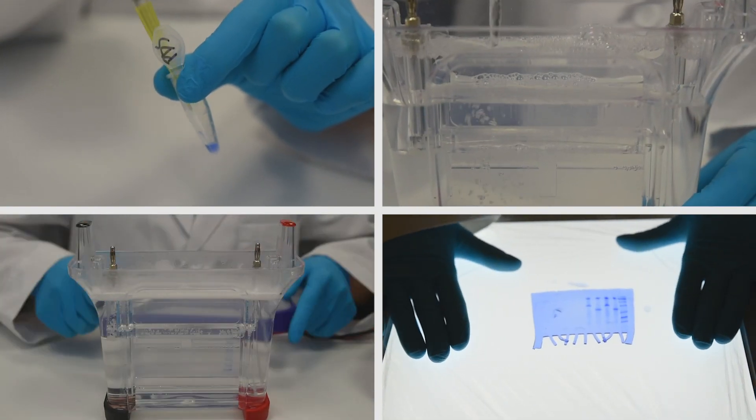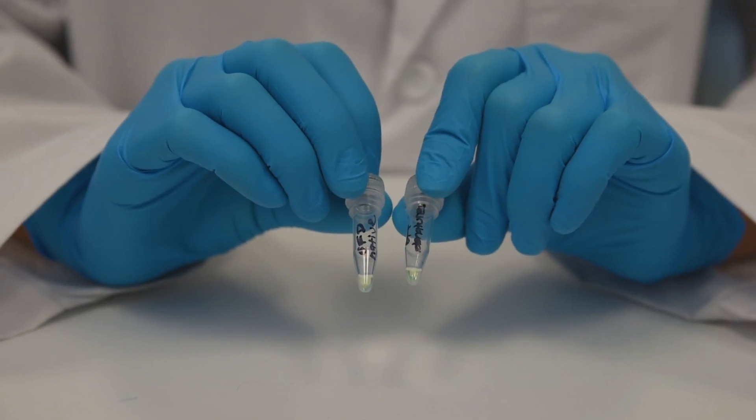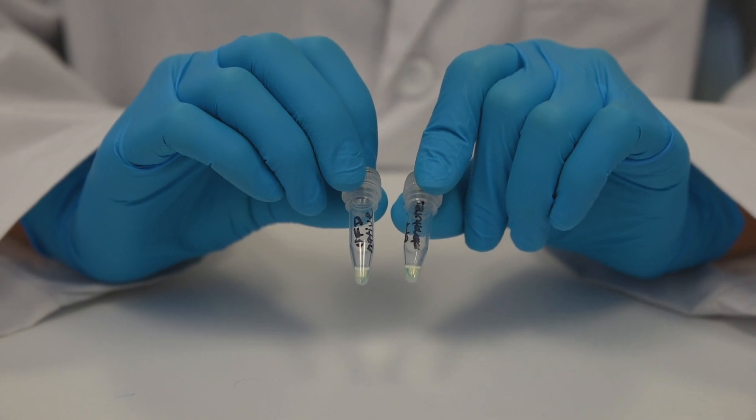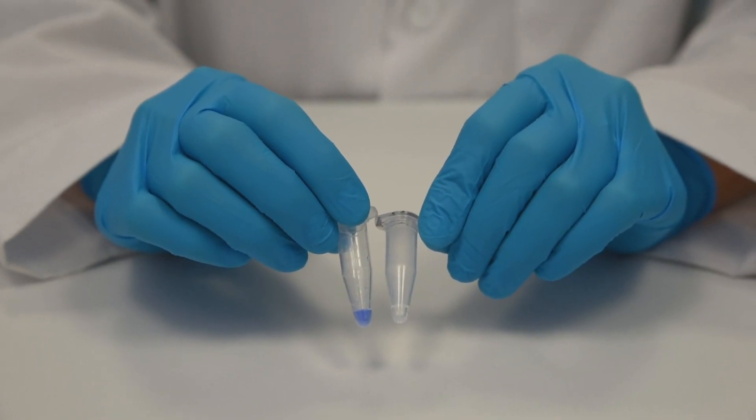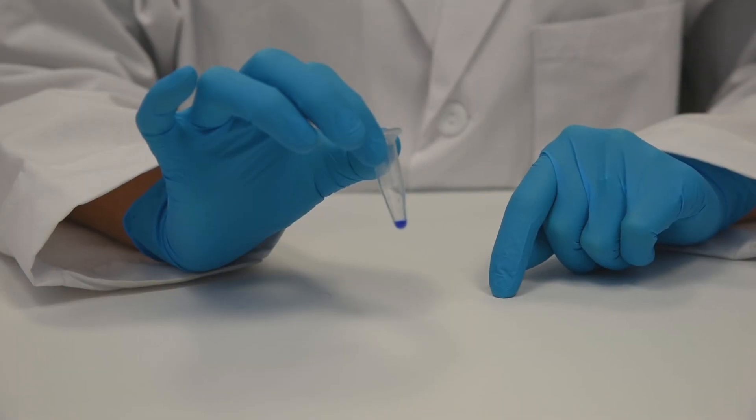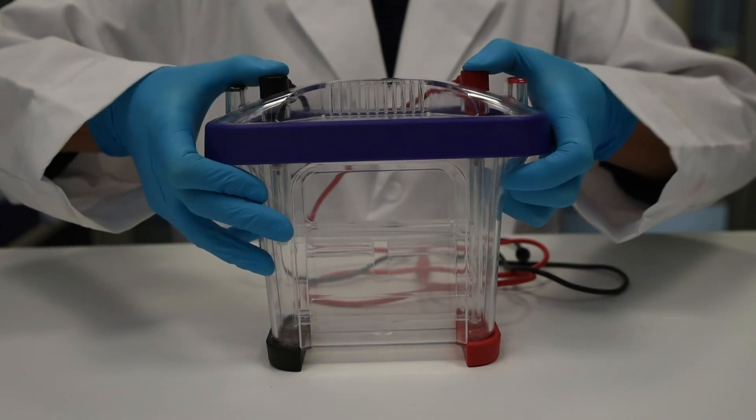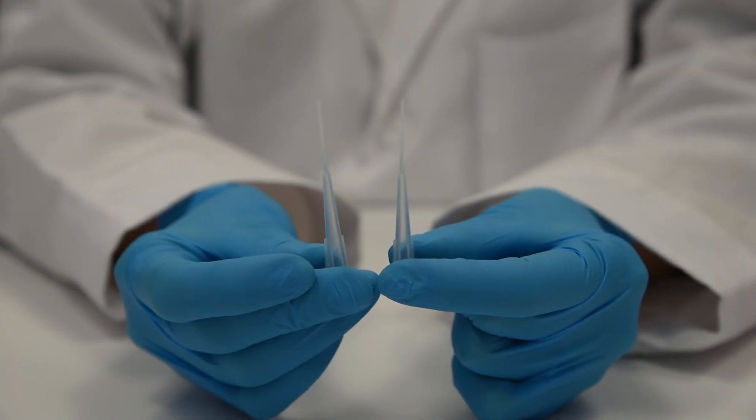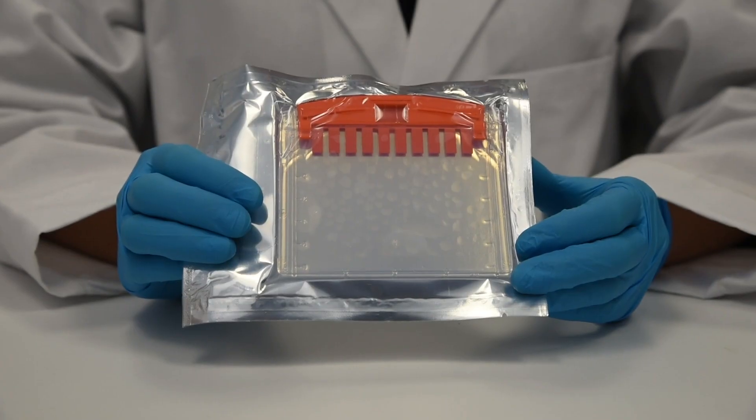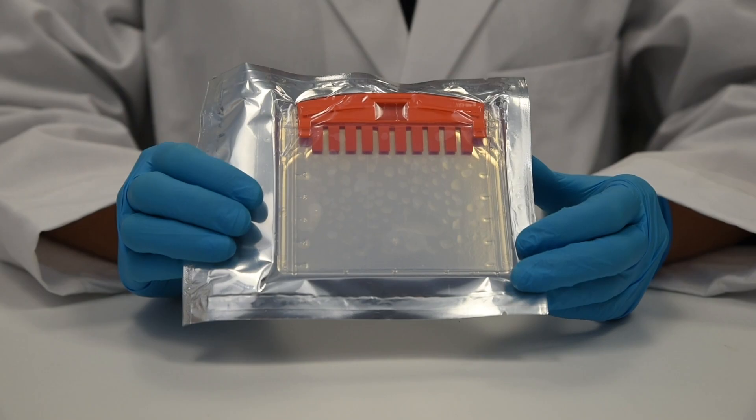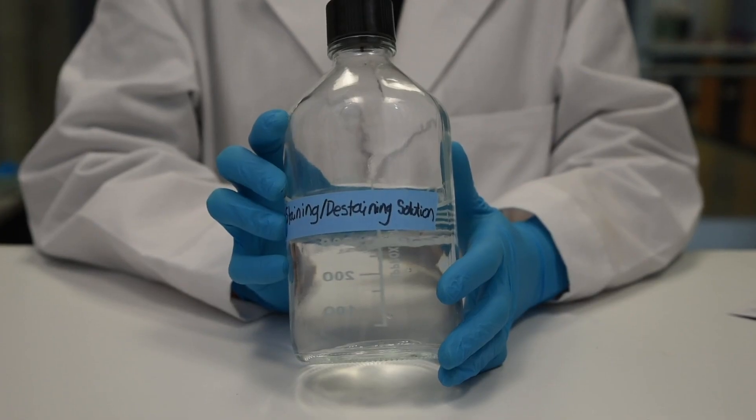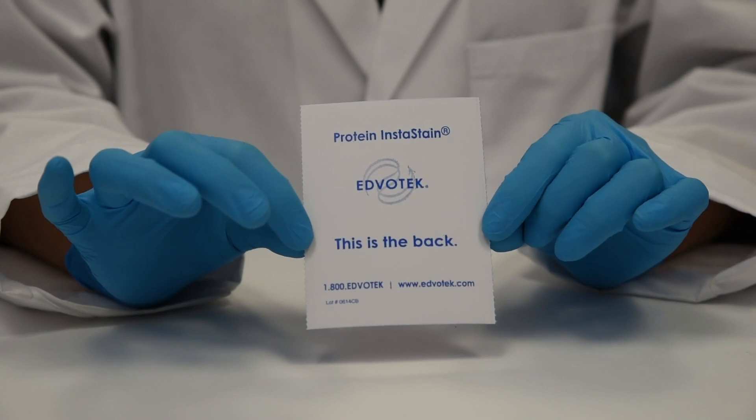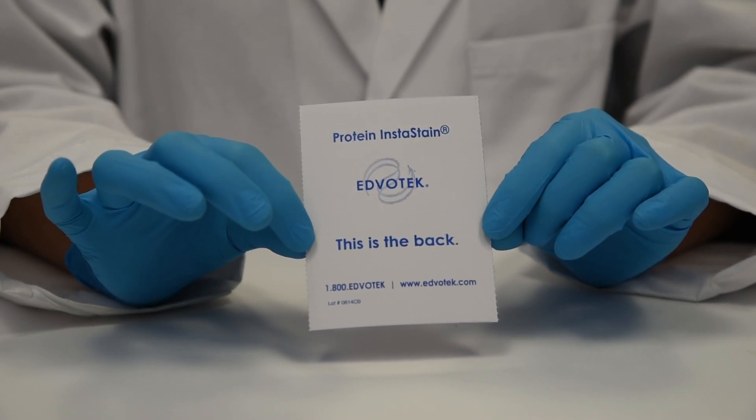For this module, you will need tubes containing purified GFP from Module 3, tubes of 50% glycerol and protein denaturing solution, rehydrated standard protein marker, a vertical electrophoresis apparatus and power supply, a micropipette and tips, an SDS PAGE gel to be shared between groups, diluted electrophoresis buffer, protein staining and de-staining solution, and finally, a protein instastain card.